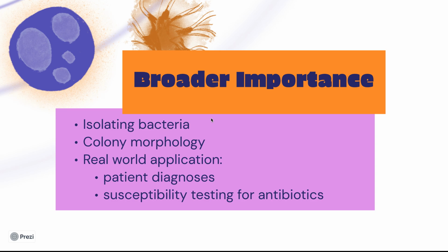All right, so the broader importance of this. My lab results contributed to a broader understanding of microbiology in a couple of different ways. Firstly, they demonstrated that you can isolate individual bacteria species from a mixed sample.